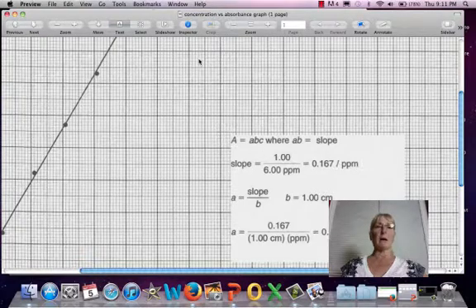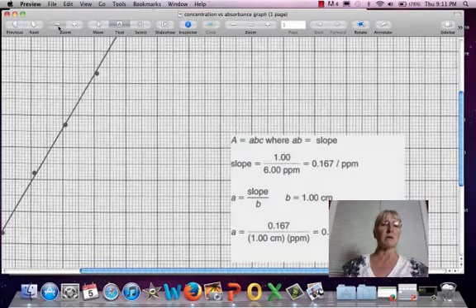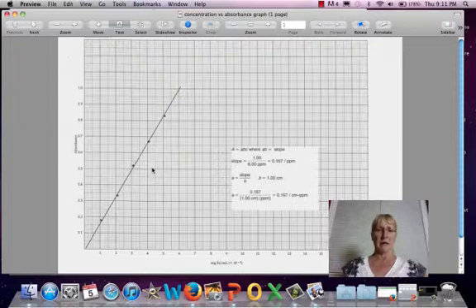Now I'm going to come back out of this a little bit and show us what this graph is presenting. If you look at the horizontal axis, just like we had the independent variable be concentration, so does this experiment.